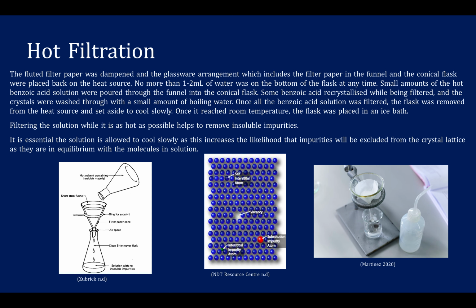Filtering the solution while it's as hot as possible helps to remove insoluble impurities. It is essential the solution is allowed to cool slowly, as this increases the likelihood that impurities will be excluded from the crystal lattice as they are in equilibrium with the molecules in solution.